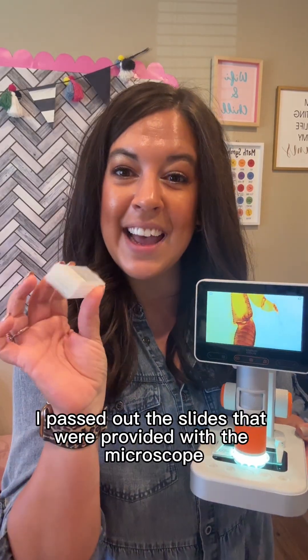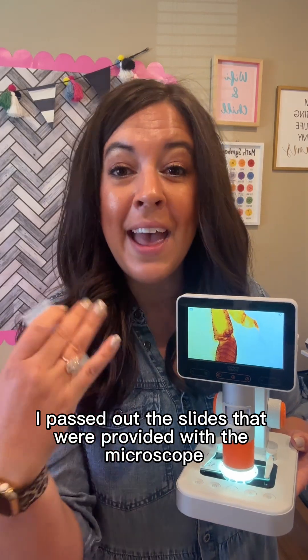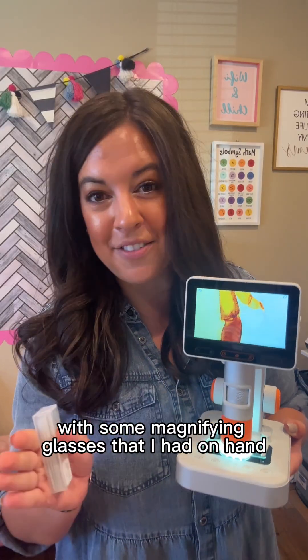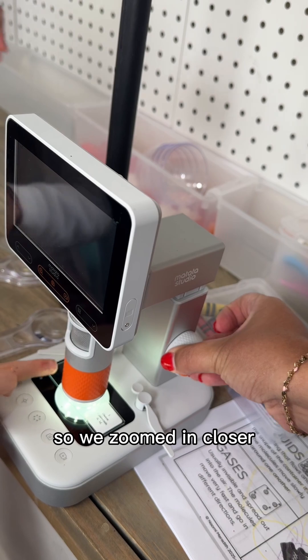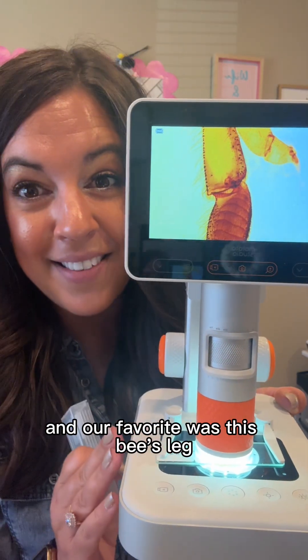When I did this lesson, I passed out the slides that were provided with the microscope and the kids zoomed in a little bit closer with some magnifying glasses that I had on hand. Of course we couldn't see everything with the magnifying glasses, so we zoomed in closer, and our favorite was this bee's leg.